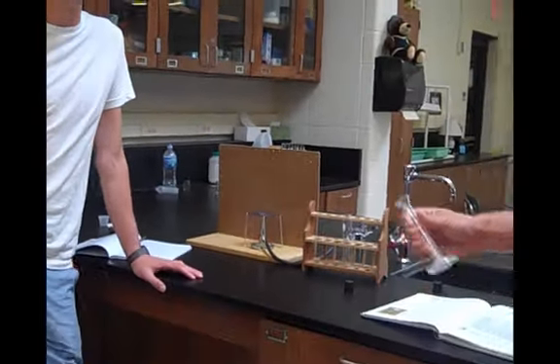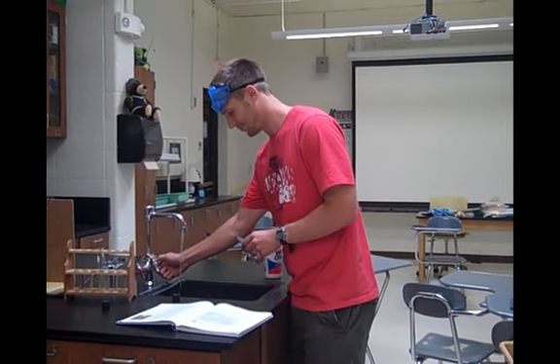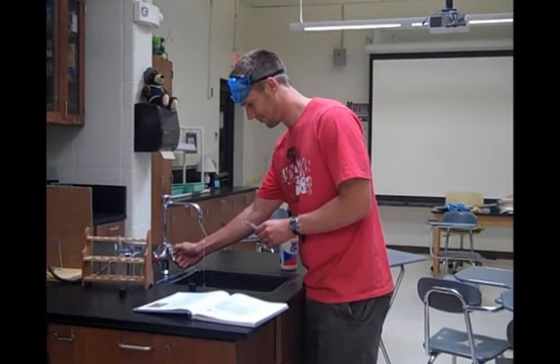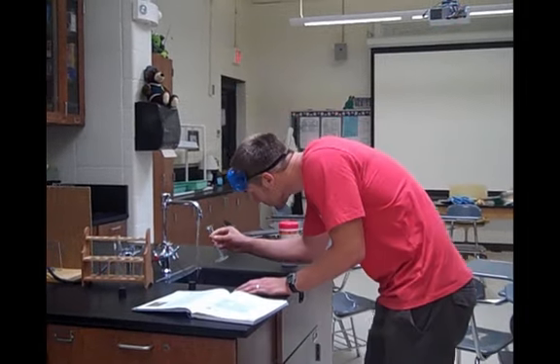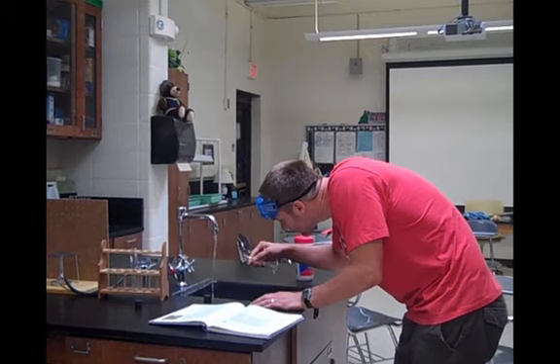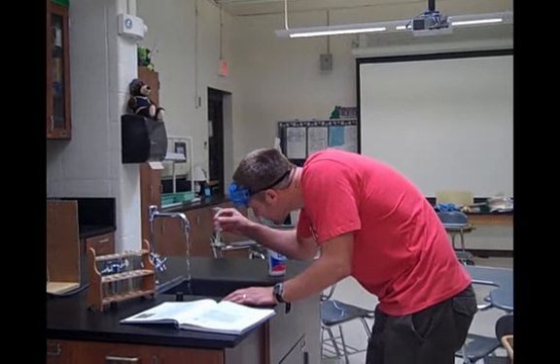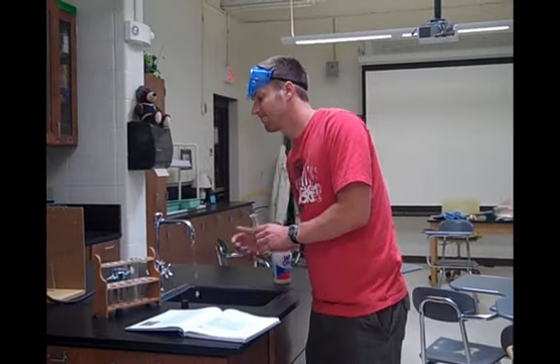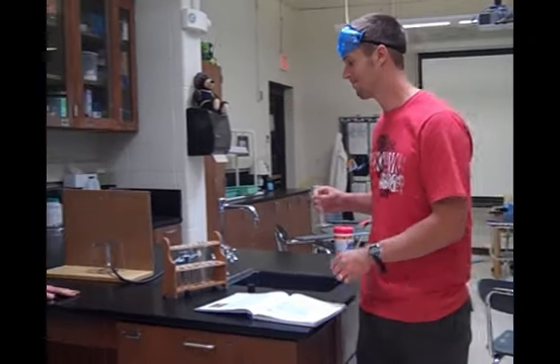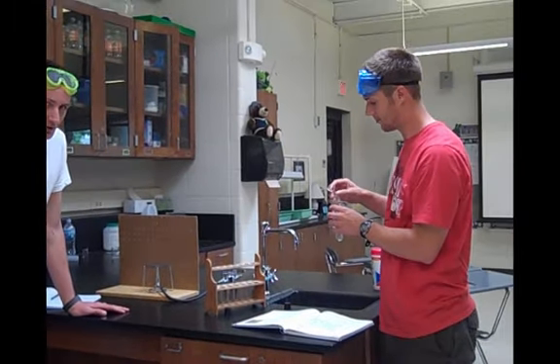Once you record the mass of your evaporating dish, you're going to want to get 5 centimeters cubed of water. Put it into your large test tube.